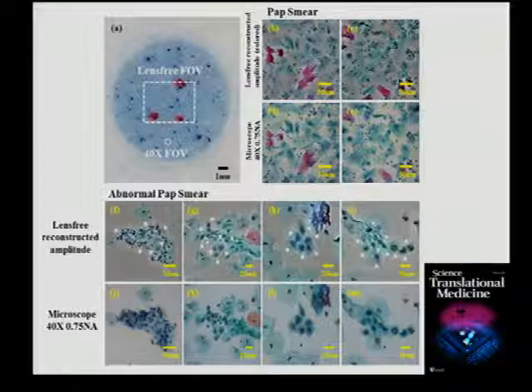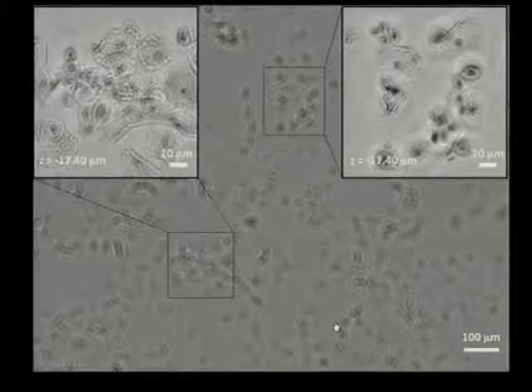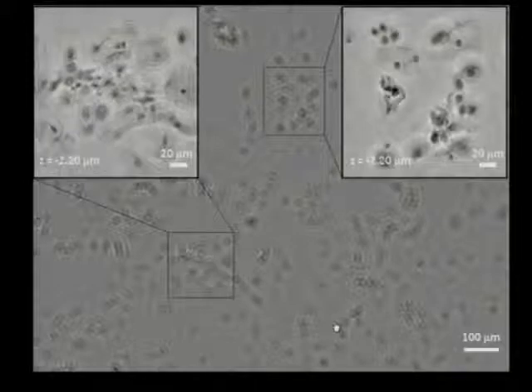This is another example. It's a Papanicolaou smear, pap smear. It's used for early screening of cervical cancer. Advantage is the same, a field portable platform for looking at large fields of view and preserving also the details. And one important advantage is you can actually take these images and send them to a remote pathologist that may be a few hundred kilometers away.